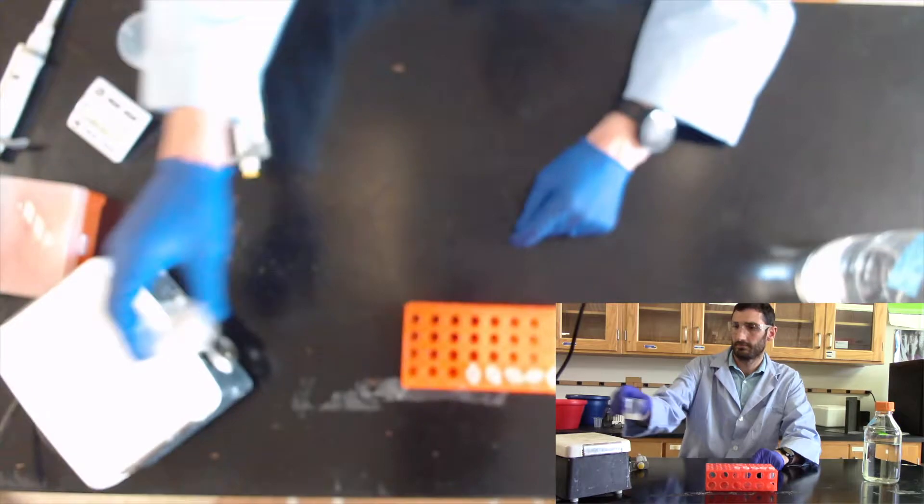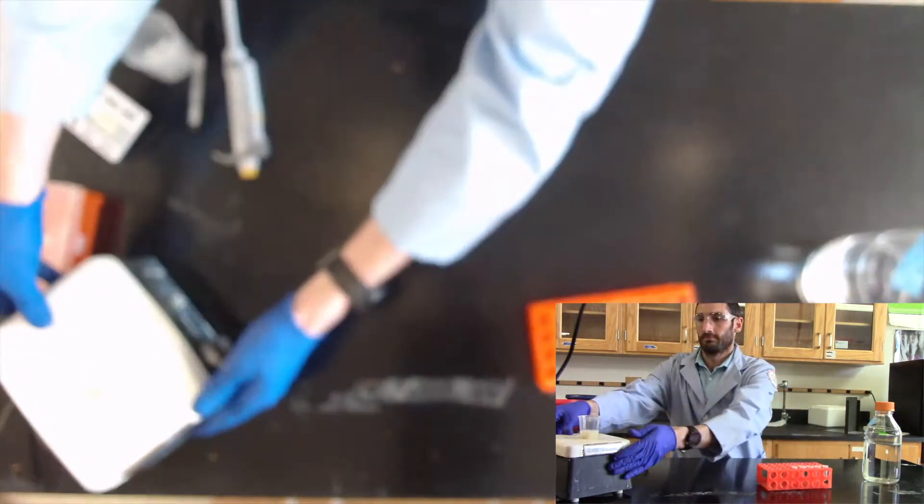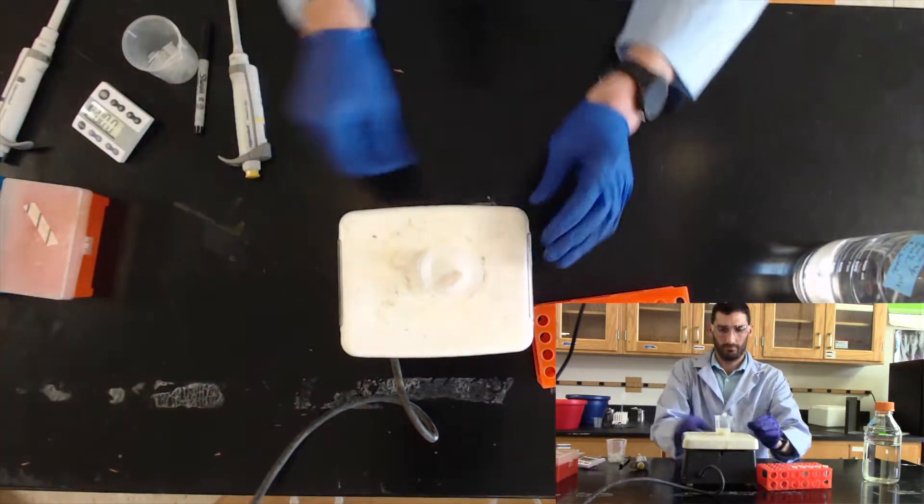Place the solution containing your buffer and cell pellet on a stir plate and stir the solution until it becomes homogeneous.